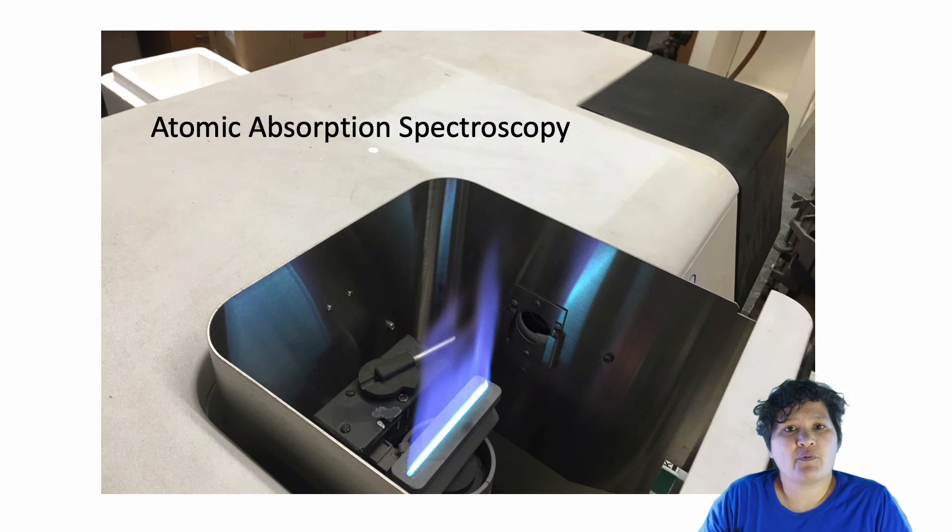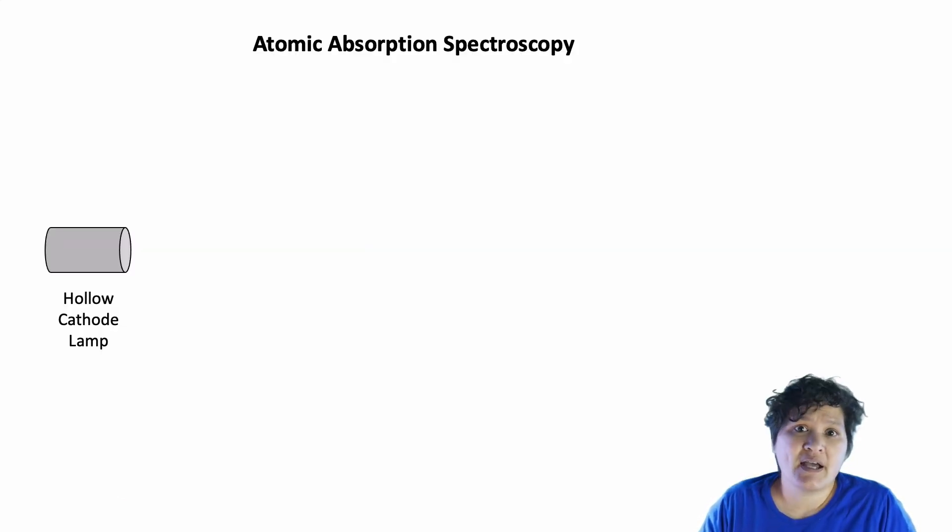The first instrument is what we call an AA, or atomic absorption spectrometer. As always, with spectroscopy, we start out with a source. Here, our source is what we call a hollow cathode lamp. Now, a hollow cathode lamp is specially designed to emit light in a very narrow band of wavelengths. But it doesn't quite work like UV-vis in that this lamp does not shine directly through the sample the way that a UV-vis spectrometer would.